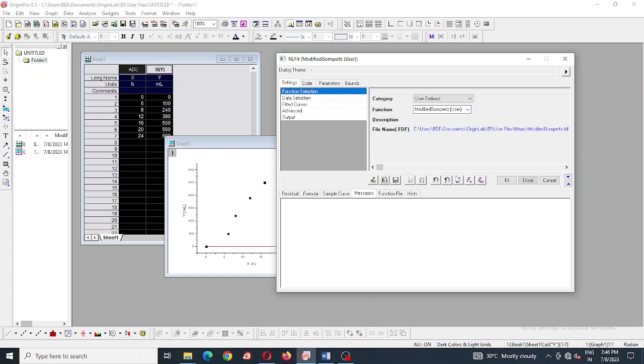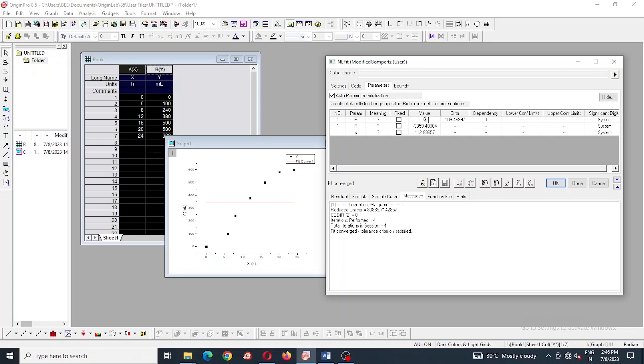Then you click that button, it will come like this, so you have to put the expected value of them.